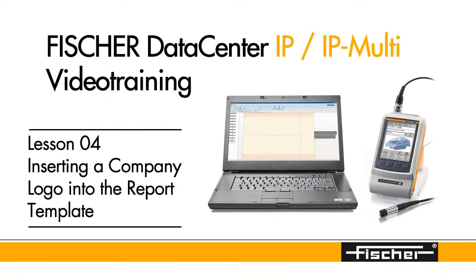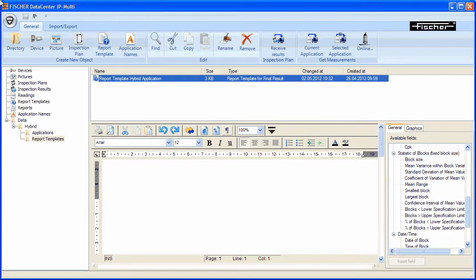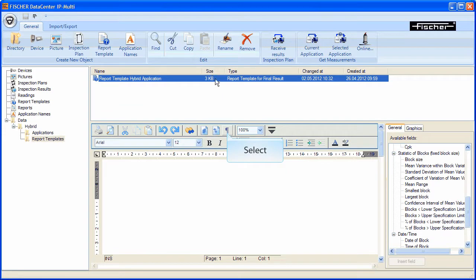Hello and welcome to the lesson on inserting a company logo into the report template. It is recommended to blend in the formatting characters in the opened report template.